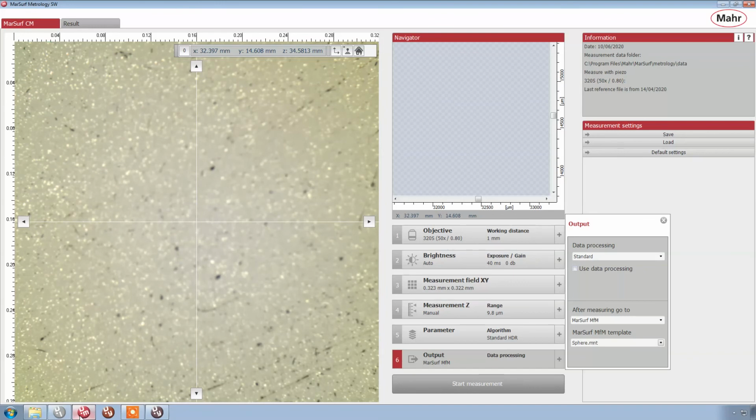I was hoping to do a piece of paper and even a bone fragment. We could have done rubber, we could have done this, that, and the other things, many different types of materials, but I'm 44 minutes into the seminar already here.